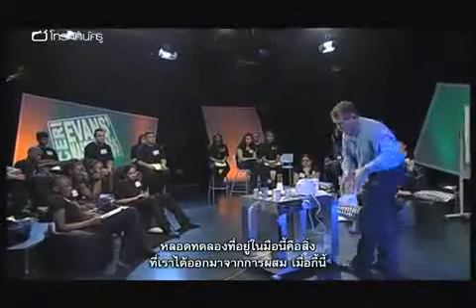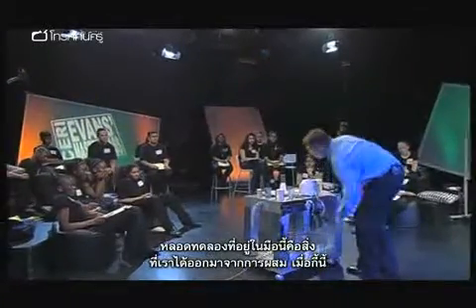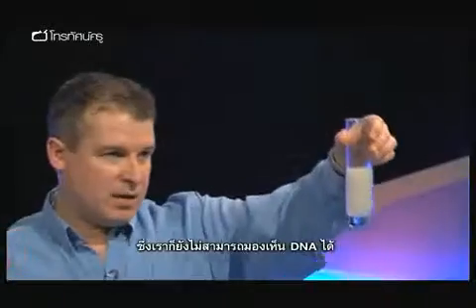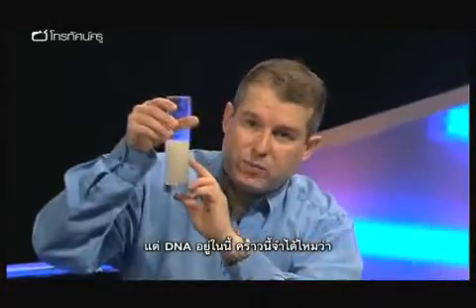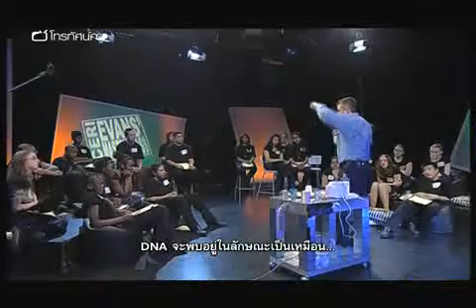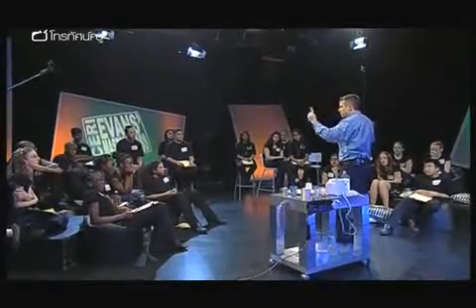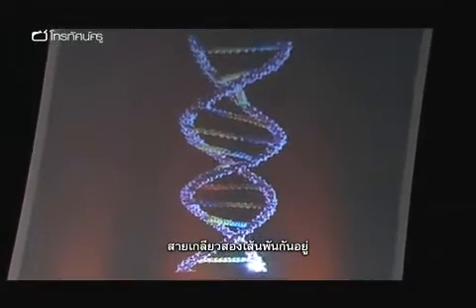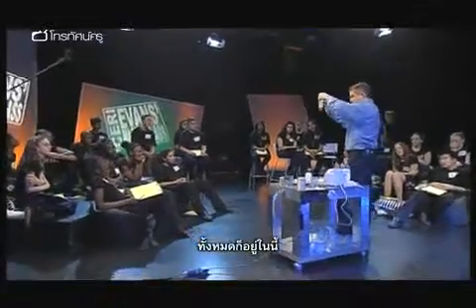Now, if I can show you what I've done earlier, just for clarity, here it is. Again, we still can't see the DNA, but the DNA is present in there. Now remember, remind me again, DNA is found as what? A double helix, okay? So DNA is a double helix strand. They're all found within there.